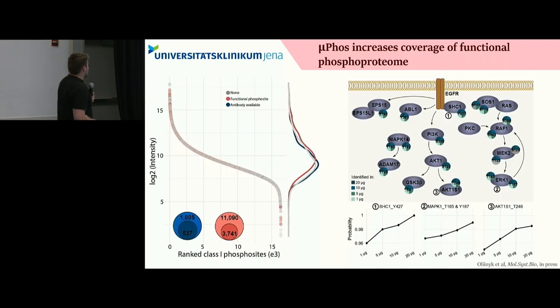And we are identifying not only a lot of phosphopeptides, we are also identifying a lot of functional phosphopeptides, so those that really play a significant role in the life of the cell or tissue. So, for example, in this experiment with EGF treatment of HeLa cells, we concentrated our attention on so-called blottable sites, so those sites that are frequently and currently used in Western blotting analysis.